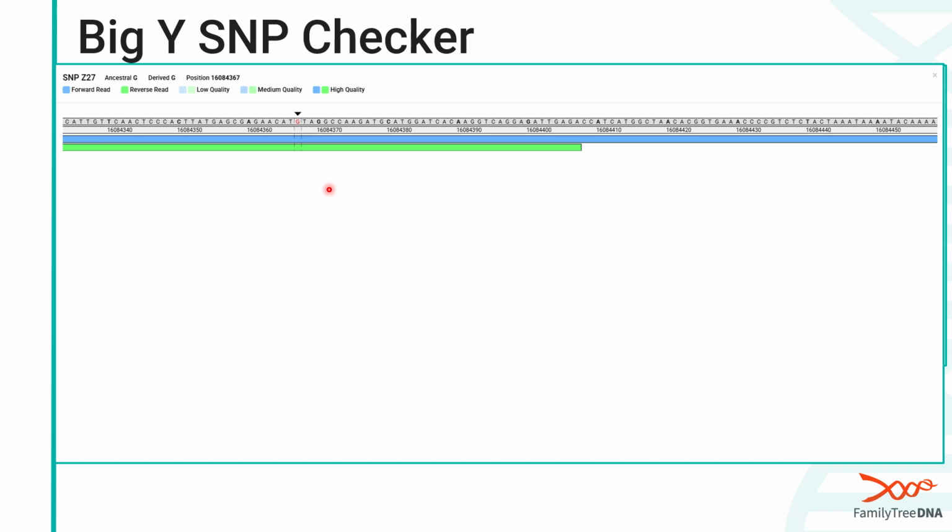So this is an example of an area where the primers weren't able to bind as clearly, and there's some areas of the genome that do that, especially if it's an area that repeats the same pattern over and over and over. It's hard to find a primer that you know is going to accurately combine to one part of that repeating pattern and not another. So this would be an example of a low coverage test.